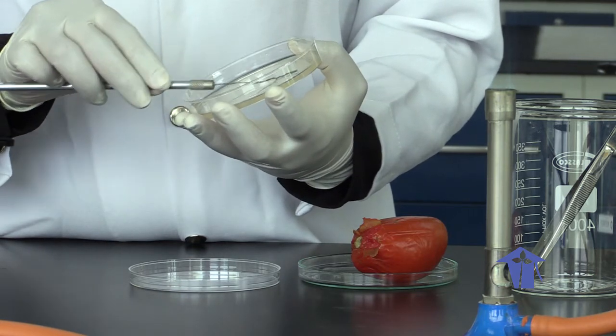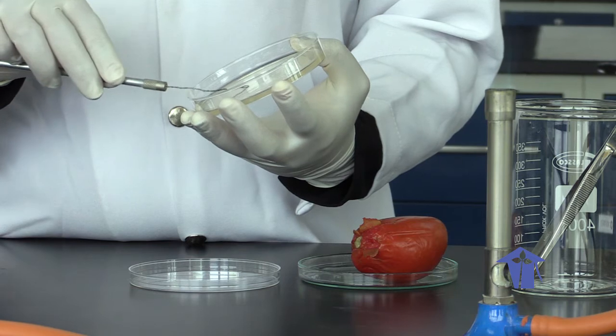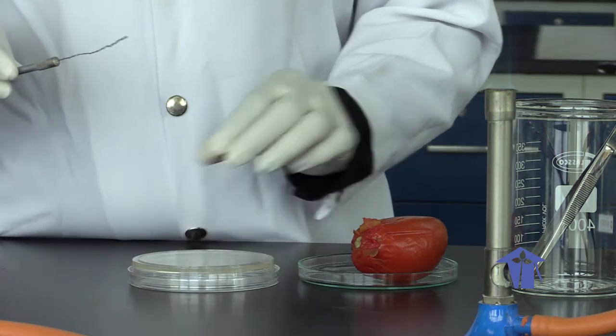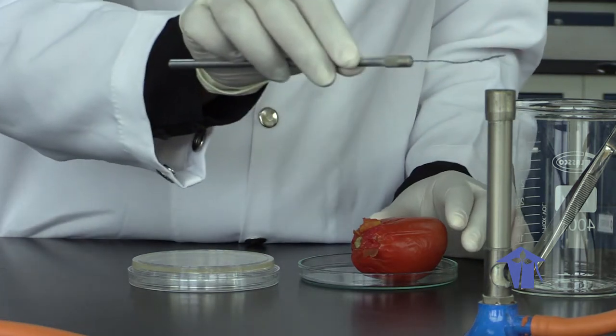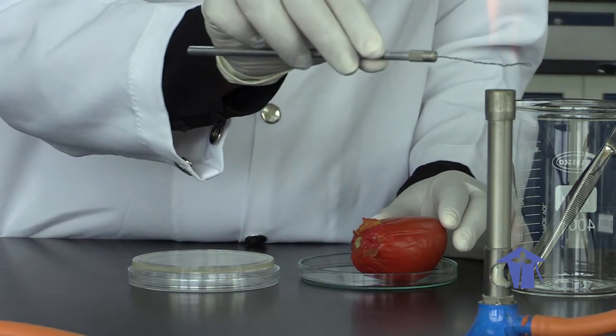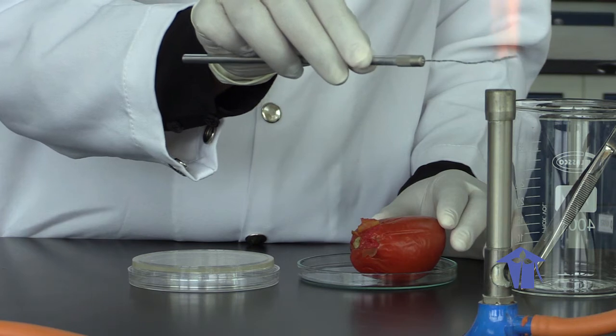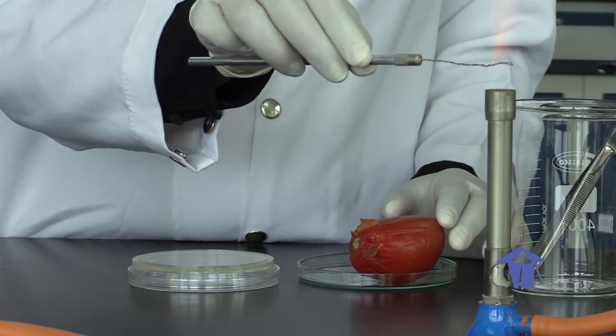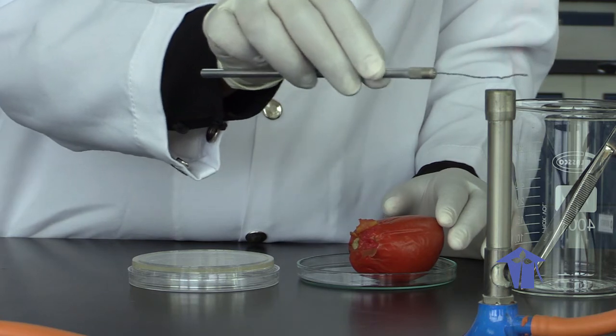Now the last streak, we bring it down to the center. Remember, you're not piercing your agar. After, we flame our loop again to re-sterilize.